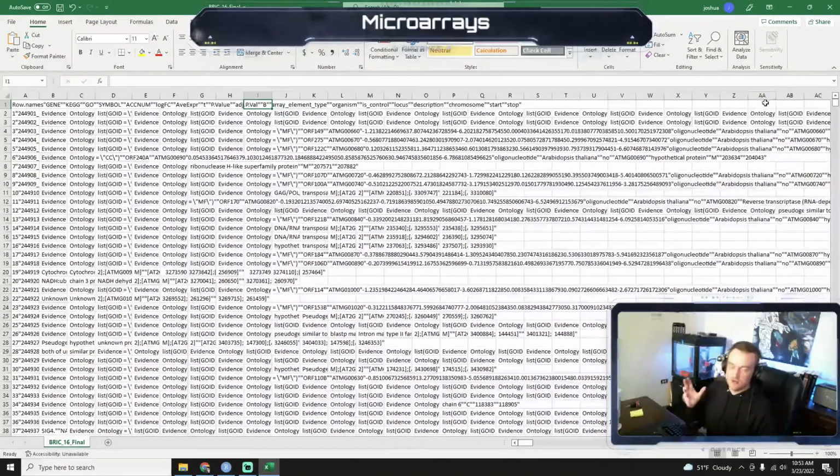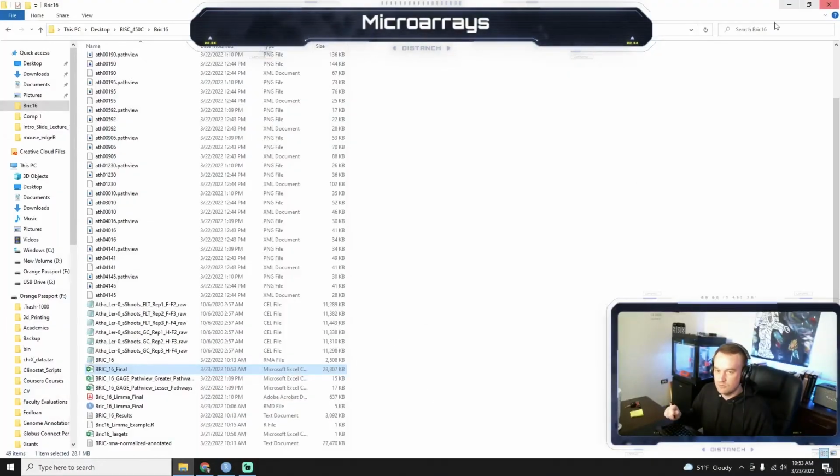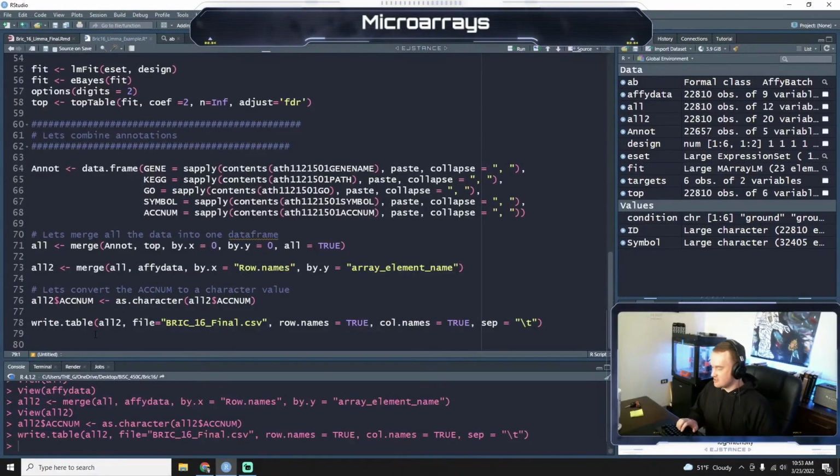We backed it up. So you don't have to rerun the session if you're going to keep running analysis on this, or if you need to send this data to someone else, and they don't have R or whatever. So we backed up all the data, which I would encourage you to do intermittently in your projects. Okay, so let's do one last thing here.